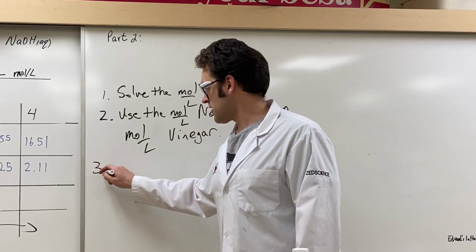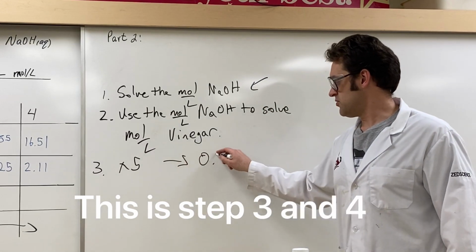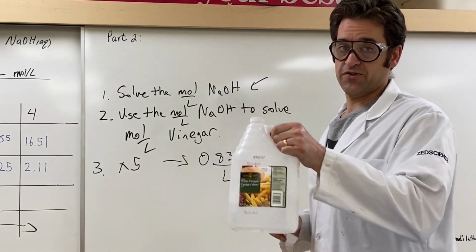The last thing you're going to do is times this by 5, and you're going to compare this to 0.83 moles per liter. And we'll see how close we are to what the manufacturer says.